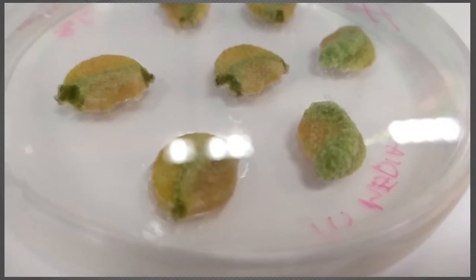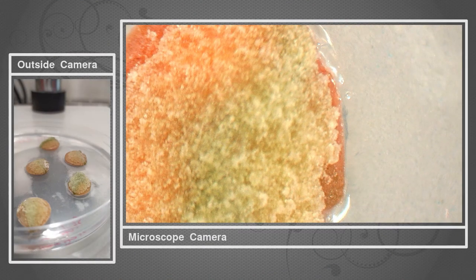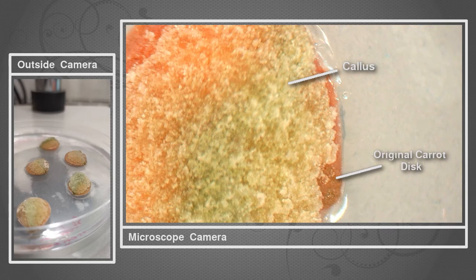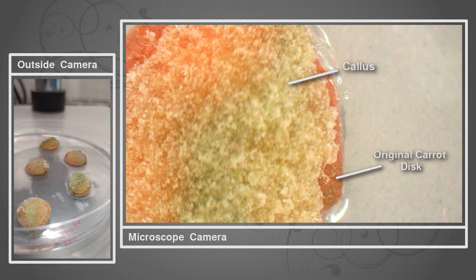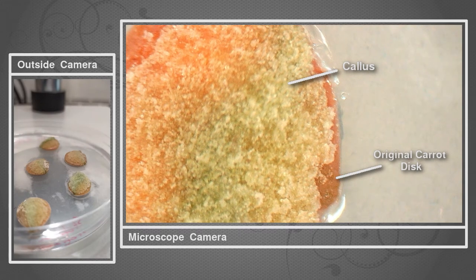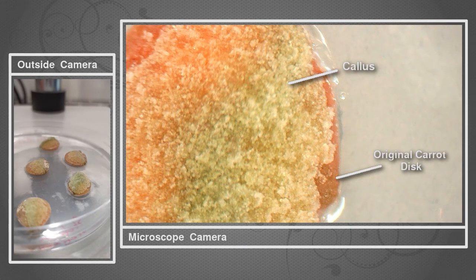What I'm going to do next is show it to you under the microscope. So here we are under the microscope. We can see one of these cali — going to focus. This is the lowest magnification I've got right now. So let's work slowly through this. We can see the surface looks very rough. We have a lot of these undifferentiated cells on the surface. I'm going to start to go to a higher magnification on this.